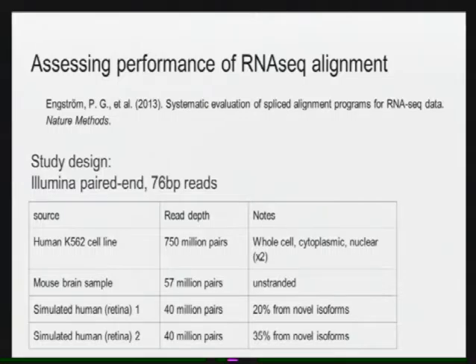Has anybody used an RNA-seq aligner or worked closely with someone who has? Can we throw out some names of any aligners we've used or are familiar with? How many have used one? Come on, hands up. Anyone? Okay, no one has used it. But you've worked with someone who has used it, perhaps? Yeah? Right. TopHat. Anybody else? STAR? Good. So there's a lot of choices. And which one to choose is a good question.